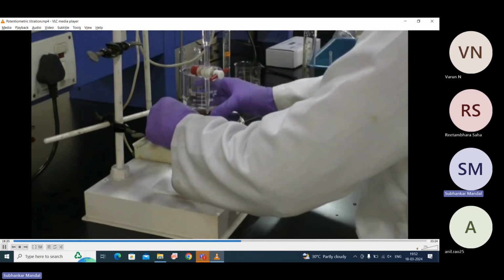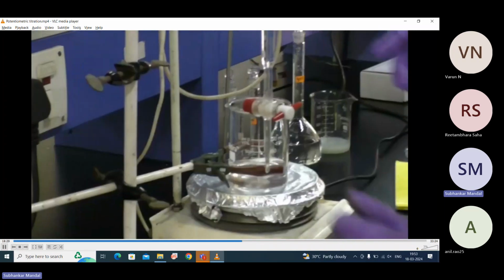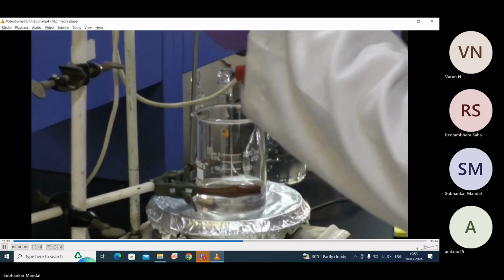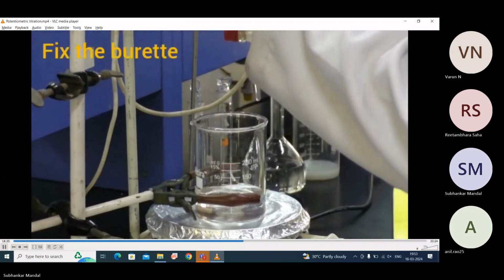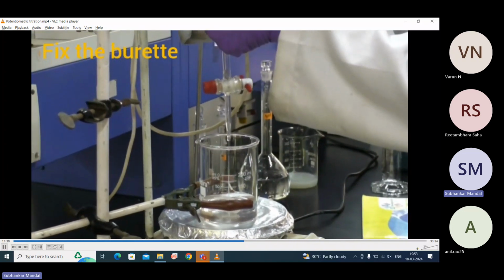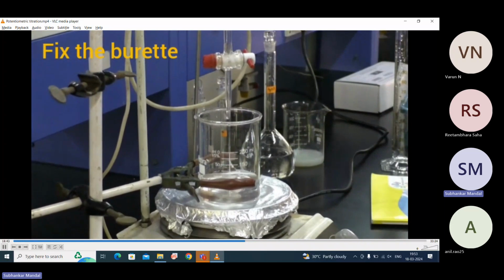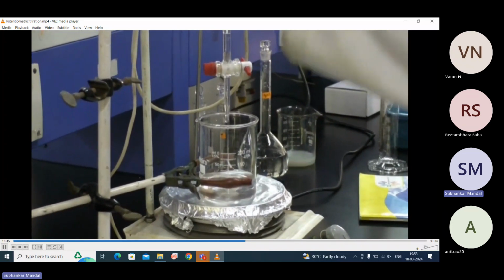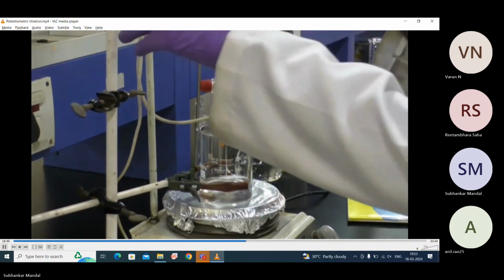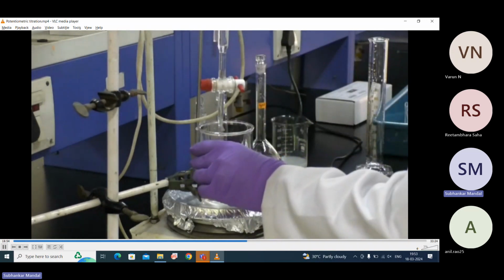So you can see, on the top we have put the burette, from where you can add the silver nitrate solution, and in the beaker we have taken the mixture of different silver halides, a mixture of halides, and you can fix all this part.